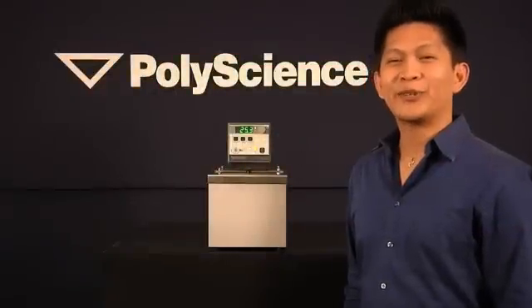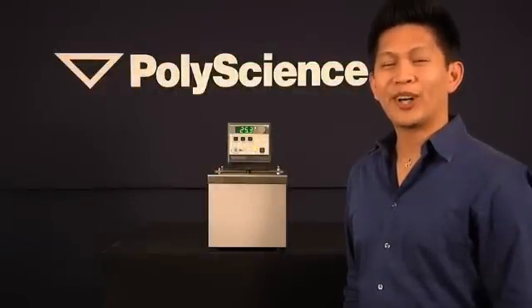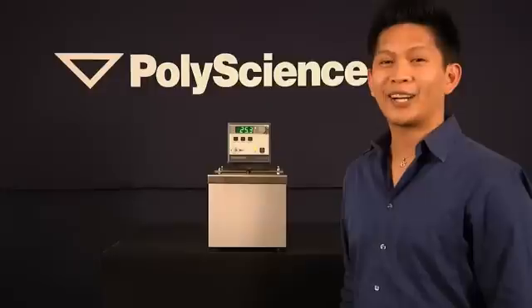Hi, Chad here from PolyScience, taking a quick minute of your time to answer one of the more common inquiries we receive here at PolyScience, the local lockout feature.